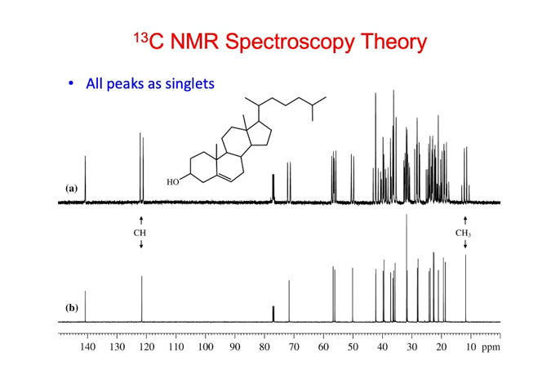Okay, just on this one, notice on the coupled spectrum here, the baseline is a lot more noisy. Why is the baseline so noisy here? Remember the way we run these experiments is that we pulse and acquire data, and we do that over and over again if we have to.